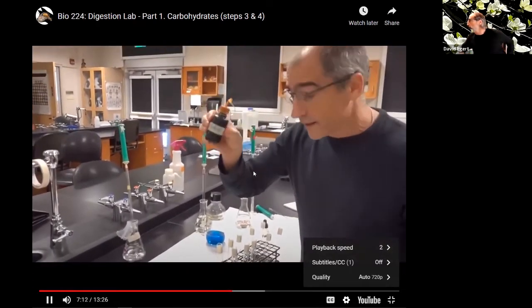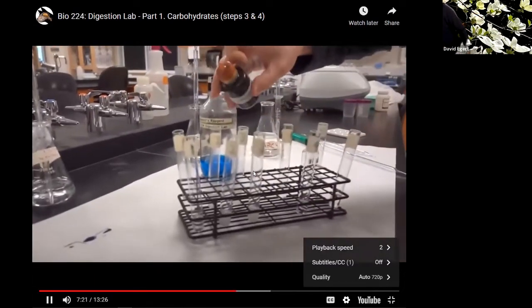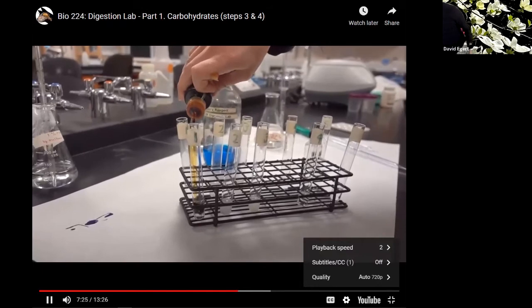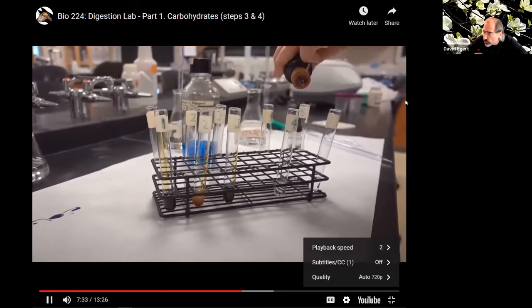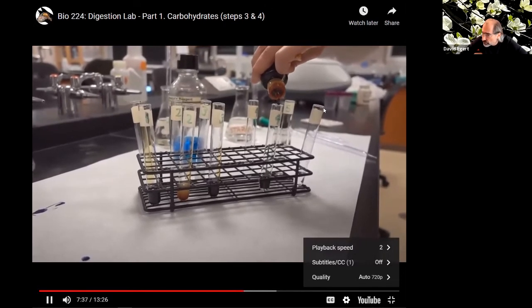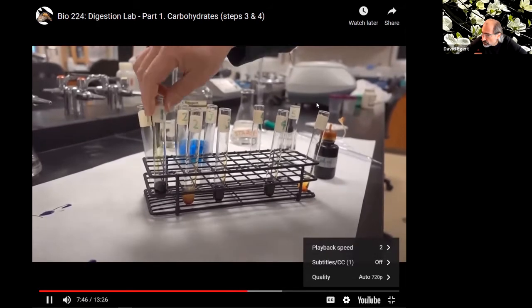We use this iodine, and this stuff's going to say 3 drops of Lugol iodine. So I'm going to put 3 drops in each of these tubes. 1, 2, 3. 1, 2, 3. 1, 2, 3. Well, that's not good. Oh, that's good. 1, 2, 3. And 1, 2, 3. All right, so we look for starch.